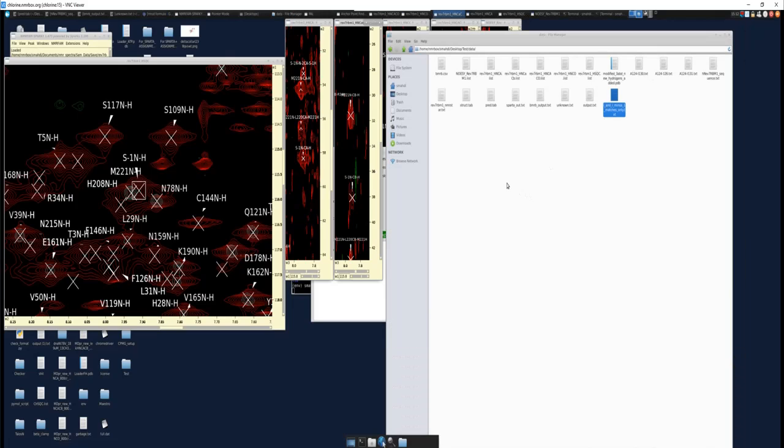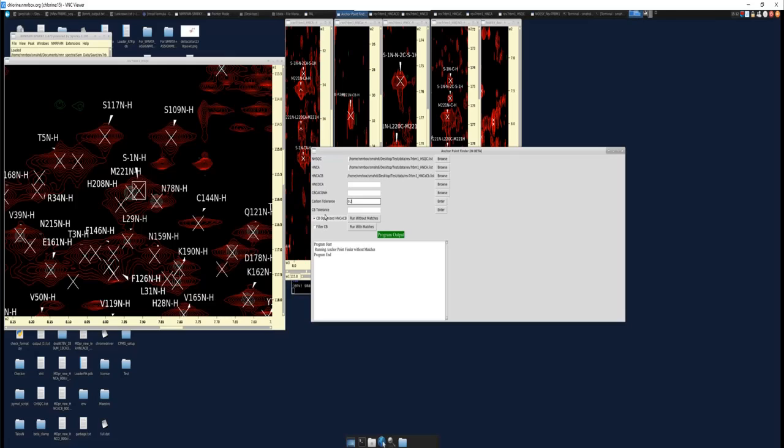There is another way to use this tool as well, though. And you'll notice here it says run with matches. So you just saw you had this huge list, right? And the goal is to use those as anchor points to find I minus 1s or I plus 1s. Because if you have 3 peaks, or 3 amino acids, that's enough to use Sparta to try and assign them.